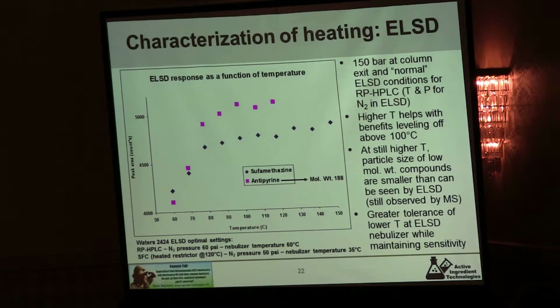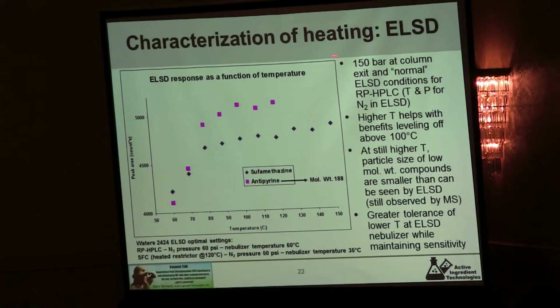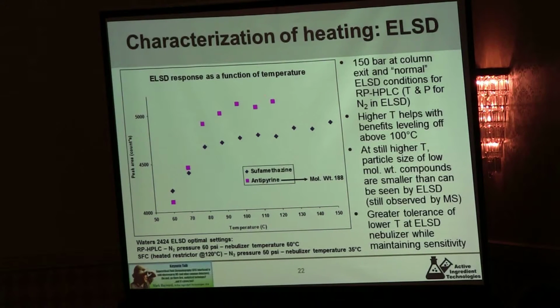Right, and we then of course did the same thing with ELSD. Now in this case, we're using the ELSD at what we knew, which was reverse phase LC conditions. But we could still get some useful data here. We could see for very small molecules, there was a limit at which the signal went away in terms of the temperature. But still promising nonetheless.